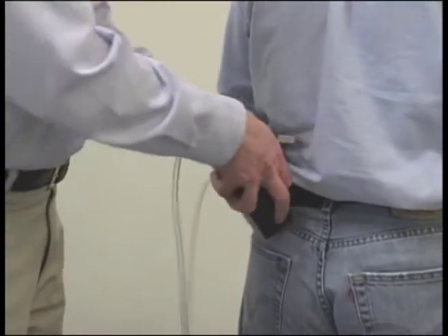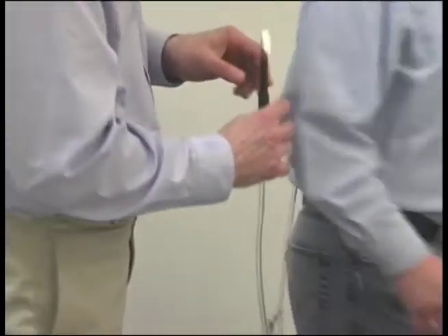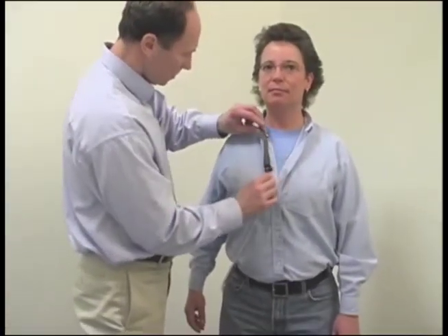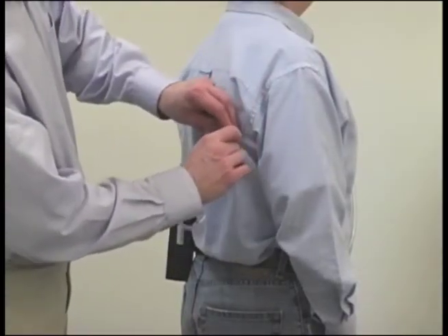Attach the pump to the worker's belt toward their side or back. Attach the sorbent tube on or near the front of the shirt collar, or as close as practical to the nose and mouth of the employee. Position the excess tubing so that it does not interfere with the work of the employee.